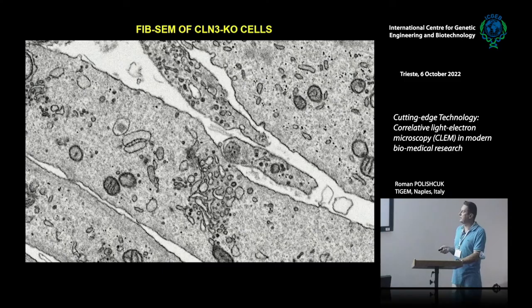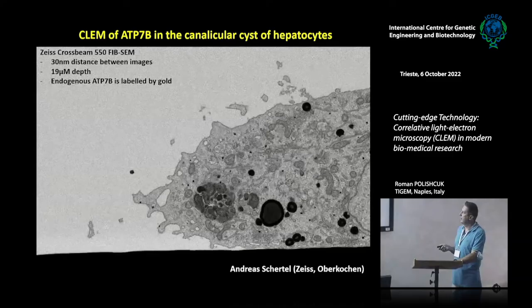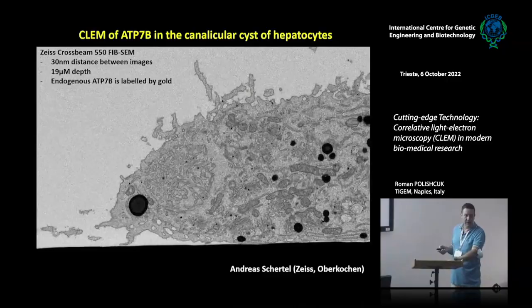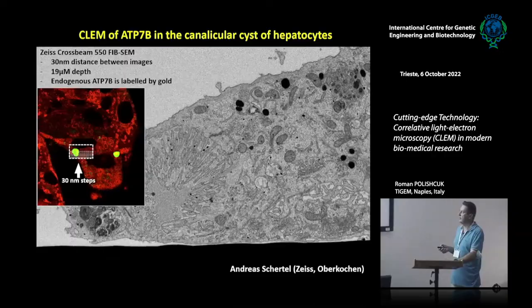This allows you to analyze pretty significant volumes, like several microns. Let me check if I have the movie here. Yeah, this works. So the movie works like this. You go through a really big volume of the cell with pretty good resolution. I will not go into detail on how the methodology works, but it allows you to take an image of an entire cell or its portion. It could even be hundreds of microns, depending on what you would like to see.